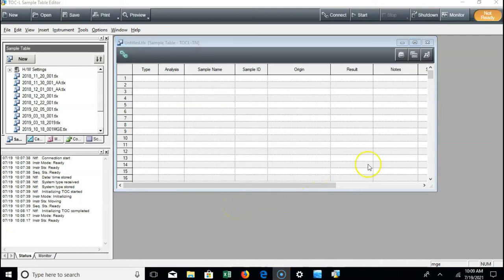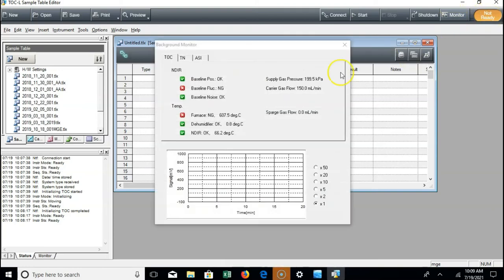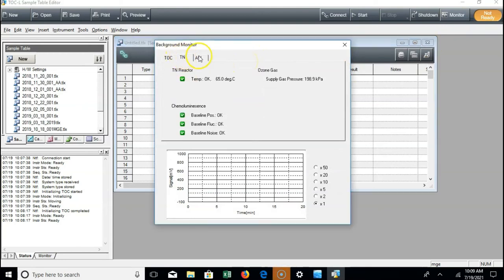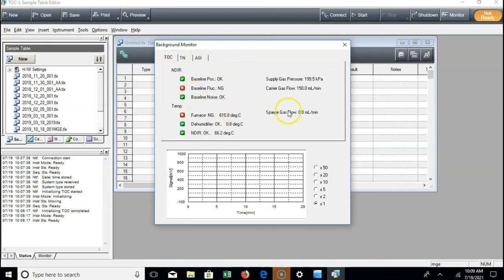Now that we're connected, you can see in the top right corner it will say ready or not ready. If you hit monitor, you'll see exactly what's ready and what isn't. We want to see the TOC, TN, and ASI tabs all have green check marks, and we want to see that the supply gas pressure is at least 200 kilopascals and carrier gas flow is at 150 milliliters per minute. Once all of these things have equilibrated and stopped changing, the instrument will change to ready and we can start our run.